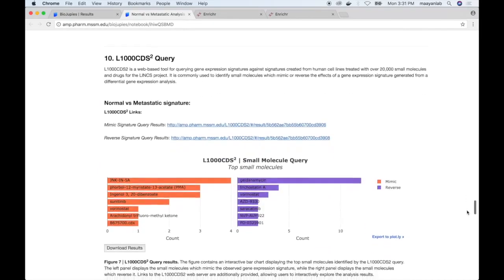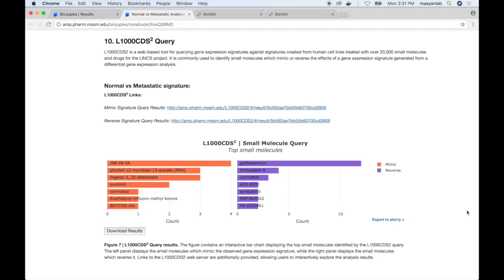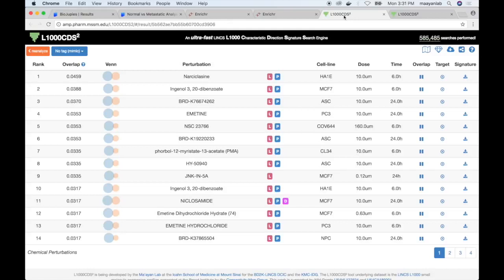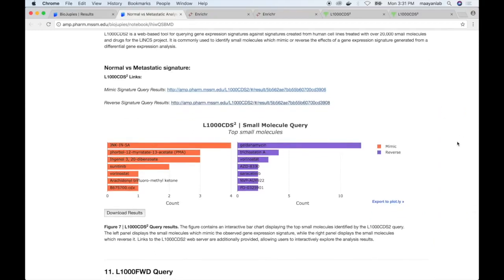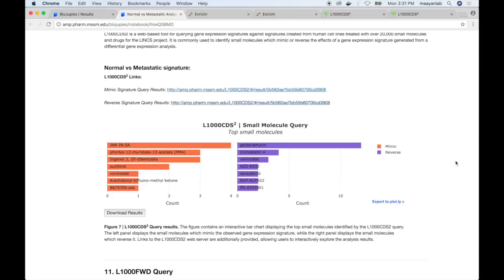The following plugin is the L1000 CDS² query, which allows identifying L1000 small molecule treatments that can either mimic or reverse the input gene expression signature. BioGP provides links to the L1000 CDS² web server displaying the top signatures which can mimic or reverse the metastatic versus normal gene expression signature. The results are also displayed as bar charts identifying the most frequent molecules — for example, Geldanamycin, a known anti-tumor drug, is observed to often reverse the input signature. The results can also be downloaded.